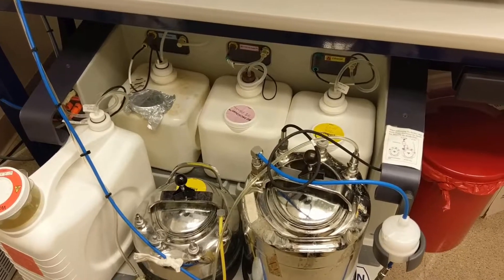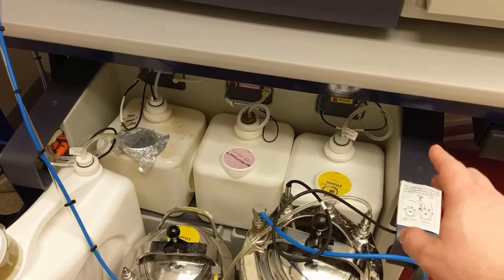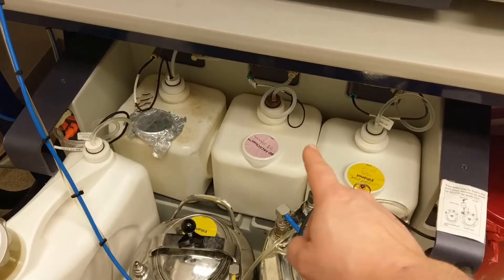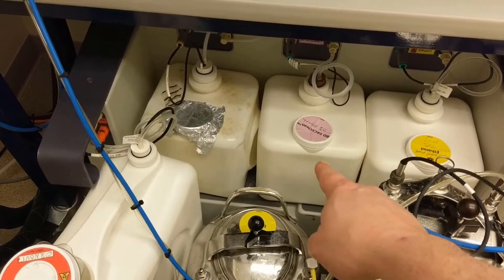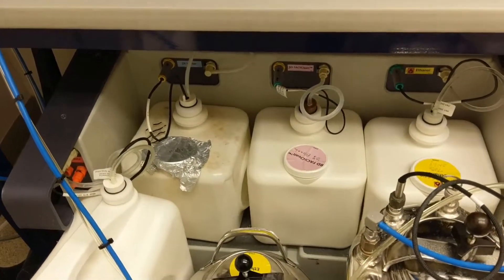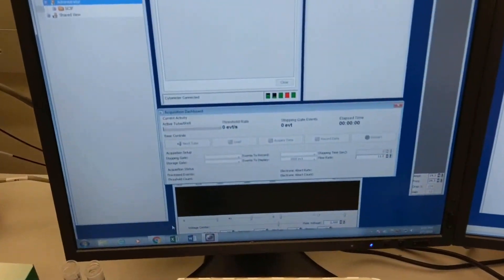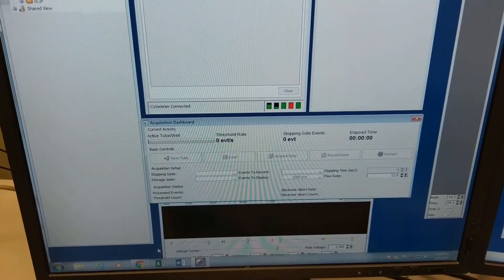In this video I want to demonstrate for the FaxAria cell sorter what you would do if you've filled up all your cleaning tanks, your ethanol tank, your FaxClean or 10% bleach tank, and your water tank, and you know everything's connected properly and full, but when you come into your Diva software you see that it's reading that one of your tanks is actually empty.